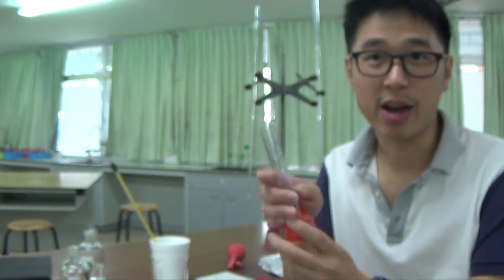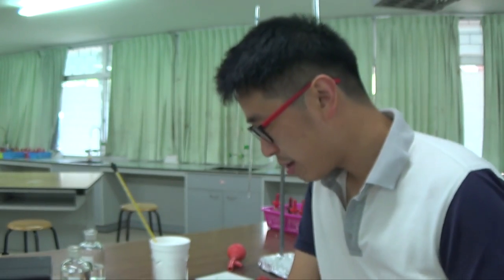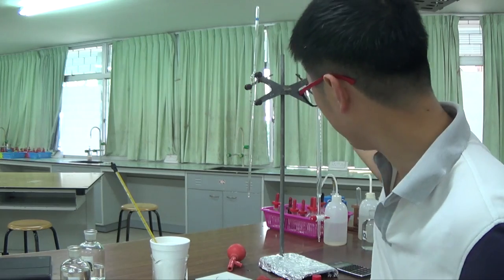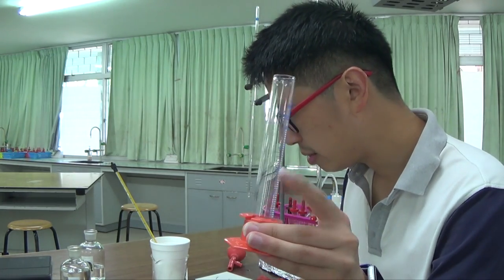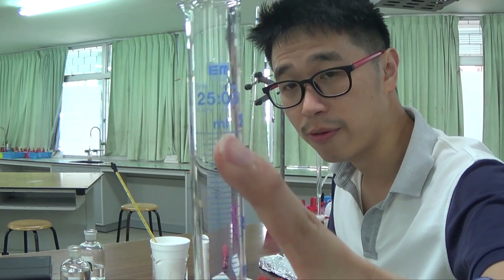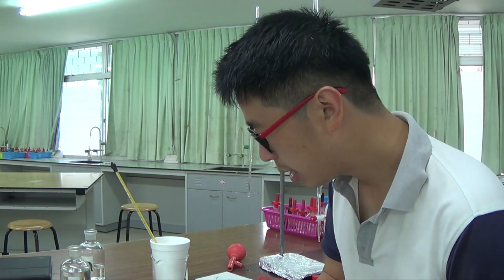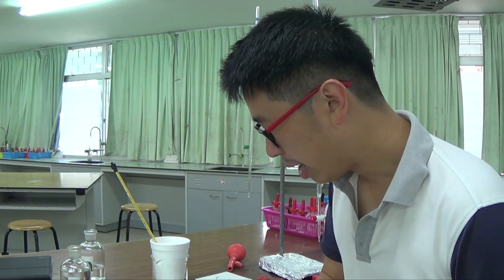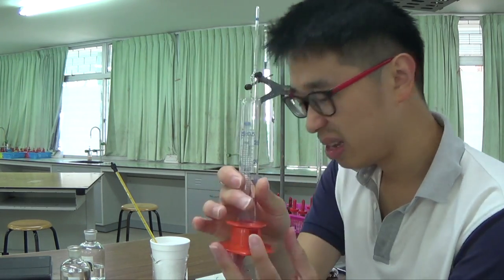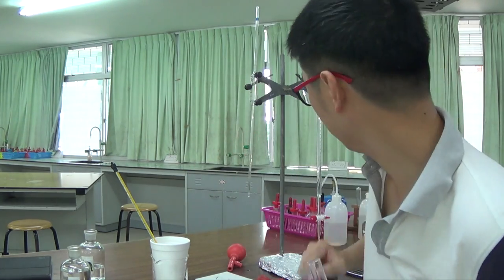And I'm back with my 25 cm³ measuring cylinder. So what we're going to do now is measure 5.0 cm³ of Q from the burette into the 25 cm³ measuring cylinder. This is a 25 ml, which is the same as a 25 cm³ measuring cylinder. We have to add water until the total volume of the liquid in this cylinder is 25.0 cm³.